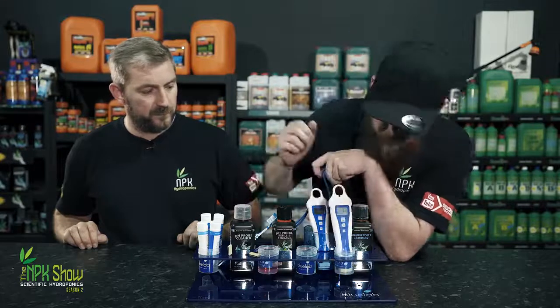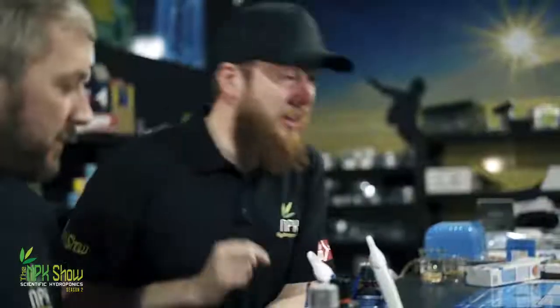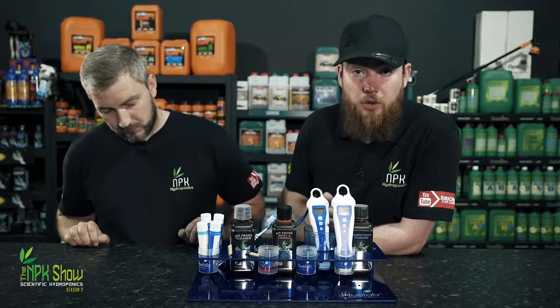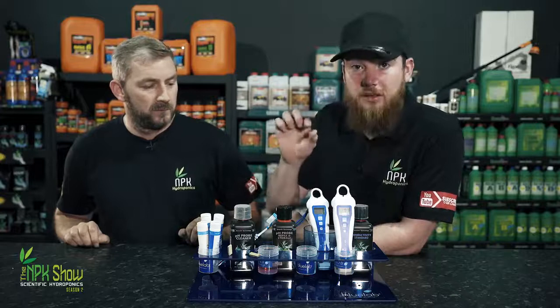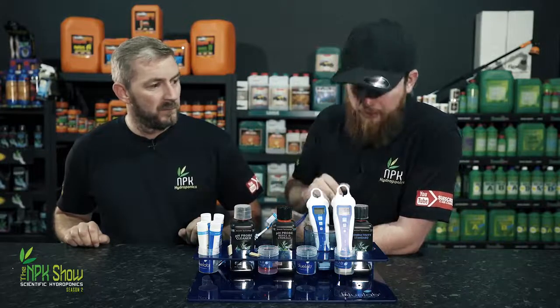First of all, you drop it in pH 7 buffer solution. Now the key with calibrating your pen is patience. It doesn't happen quickly. It can take up to 4 to 5 minutes to properly calibrate your pen. And you've got to wait for the figure to settle for maybe even a minute. If it moves up or down, it's still finding its right balance.